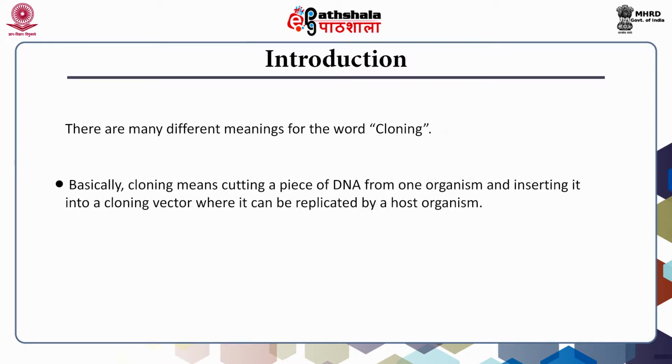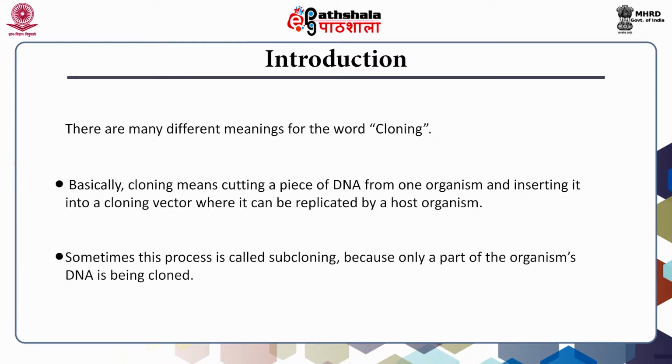Basically, cloning means cutting a piece of DNA from one organism and inserting it into a cloning vector where it can be replicated by another host organism. Sometimes this process is called subcloning because only a part of the organism's DNA is being cloned.